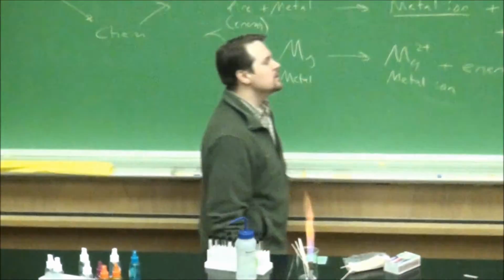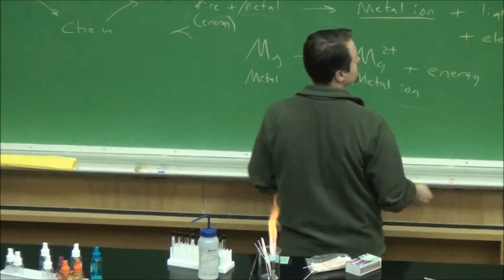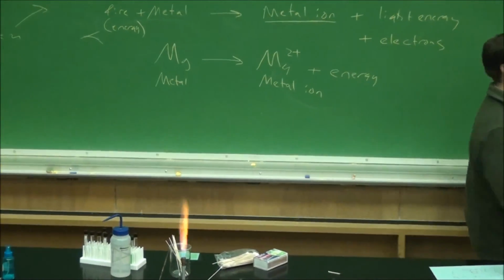So that's the basic demo for the afternoon. Do you guys have any questions about it? Are the solvents all different? No, the solvent's all the same. The solvent's methanol. Did you guys like that one? Yeah.